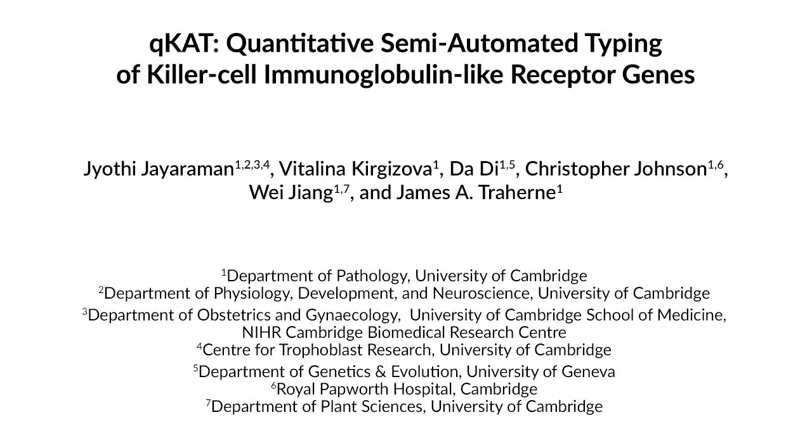This method can answer key questions about NK cell receptor genetics, such as haplotype diversity and how this relates to disease. Visual demonstration of this method will help to set up protocol in your laboratory, including the automation process and data analysis.